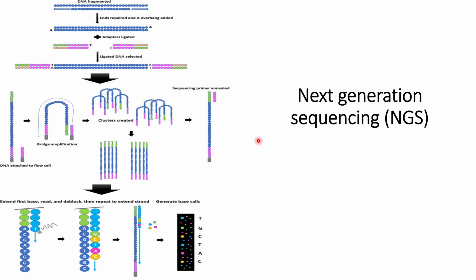And then later on, based on this barcode, the samples can be analyzed and separated towards the experiment to which this DNA fragment belongs.